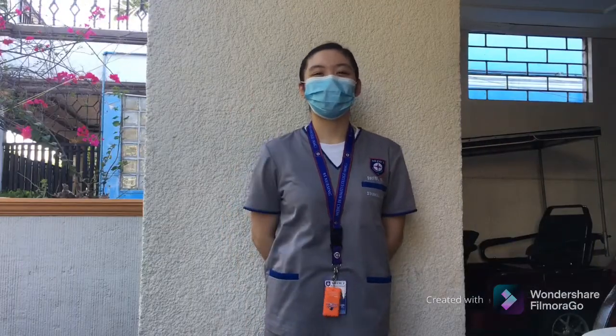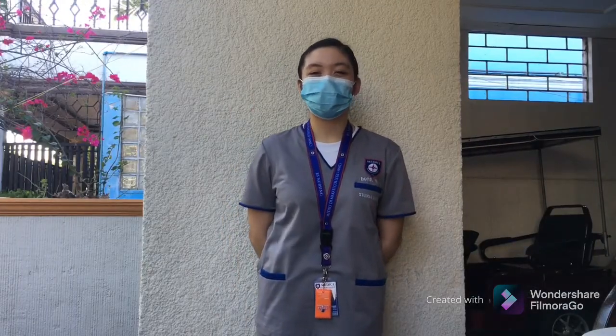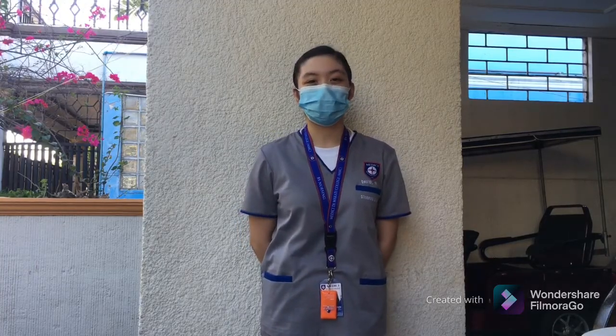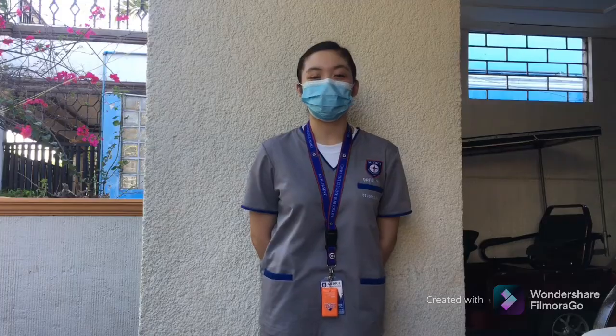Hi everyone! I am David Dion D from BSN 1A and for today's video, I will be performing the donning and doffing of PPE.